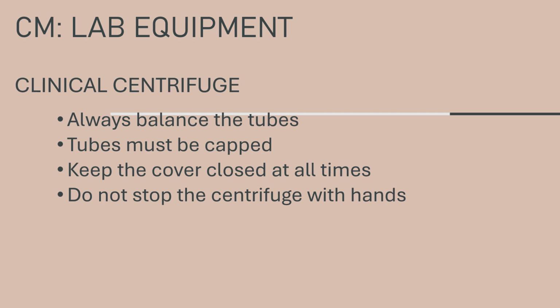Tubes must be capped accordingly to avoid spillage and aerosol formation that will be a source of biological hazard. Possible evaporation may also occur if the tube is uncapped, since heat is generated during the spinning process and will cause evaporation of your liquid. Keep the cover of your centrifuge closed at all times, even if you're not using it.